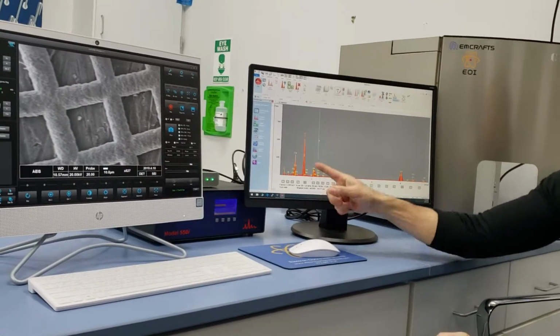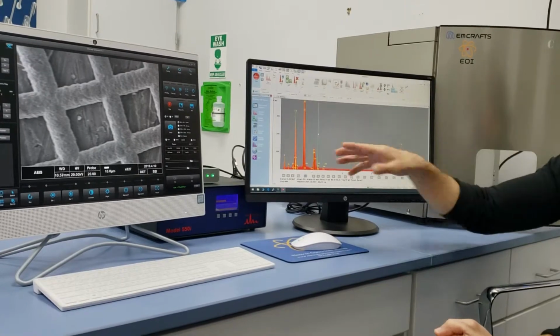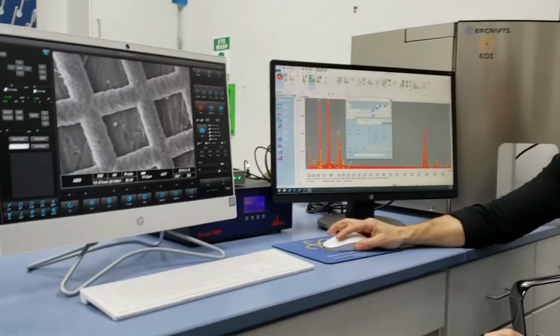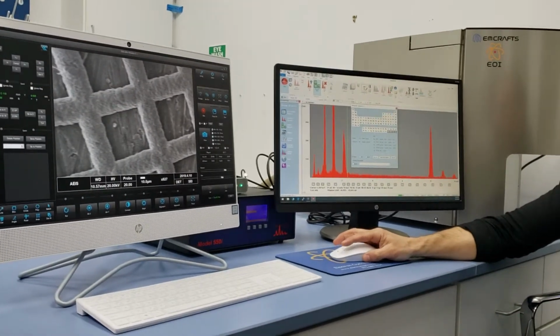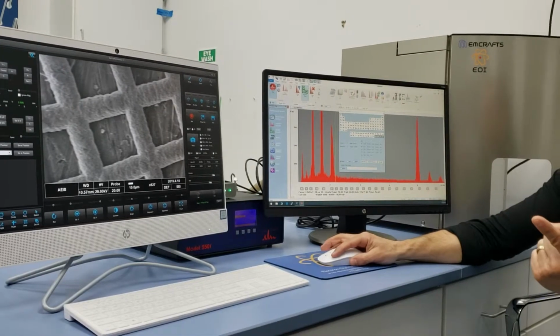Great. It remembered the labels from previous that I labeled. So that's why it's labeled right now. It didn't know it. It wasn't smart. It didn't do it all on its own. It remembered. We were on an ID here and see how it remembered everything. So I just go clear a list and it clears a list. The first way of labeling again was, I'm going to hit stop. I don't feel like waiting for the spectrum.